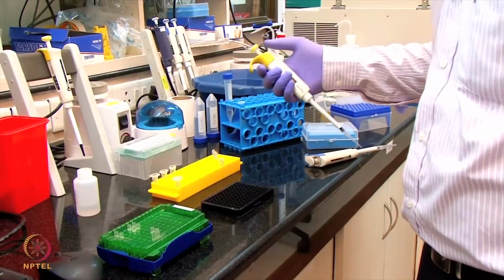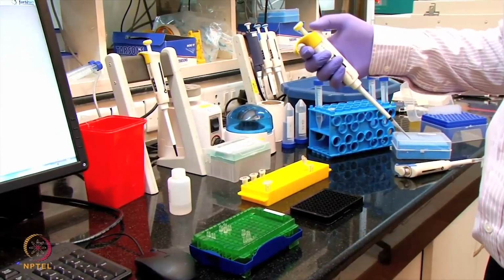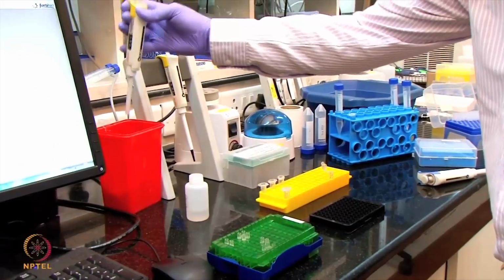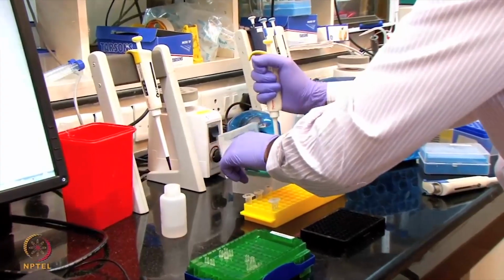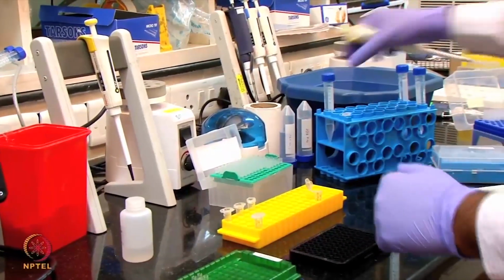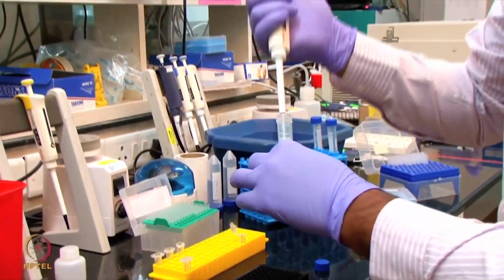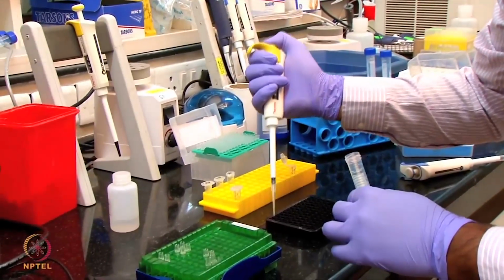Now I am going to demonstrate how we are going to immobilize the anti-apolipoprotein onto the streptavidin sensor. I am taking 200 microliter of the 1x PBS buffer. This is prepared. I am going to add 200 microliter to each well of the 96 well plate.